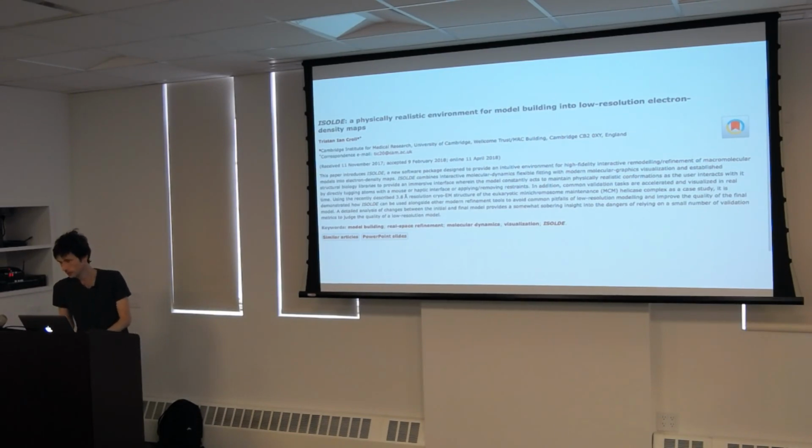How's this different from Rosetta or any others? Well, Rosetta is very different because with Rosetta you're dealing with local sequence fragments. This is using a physical force field and a model of your complete protein. Rosetta is great for building an initial model if you have the computational horsepower to get it to go.